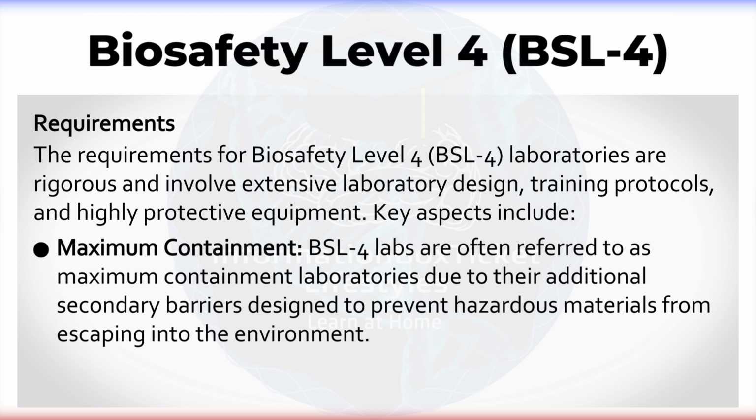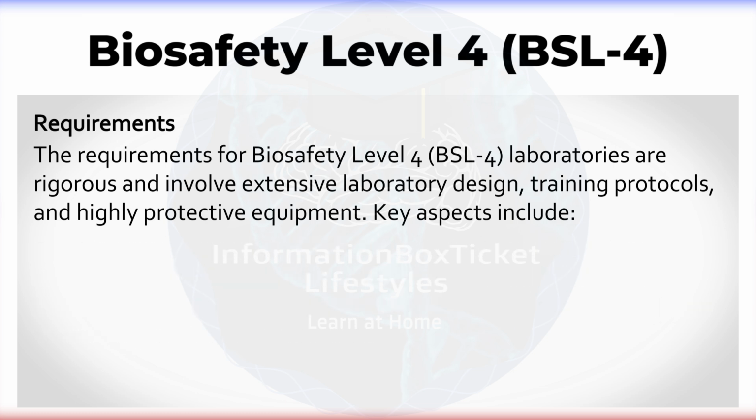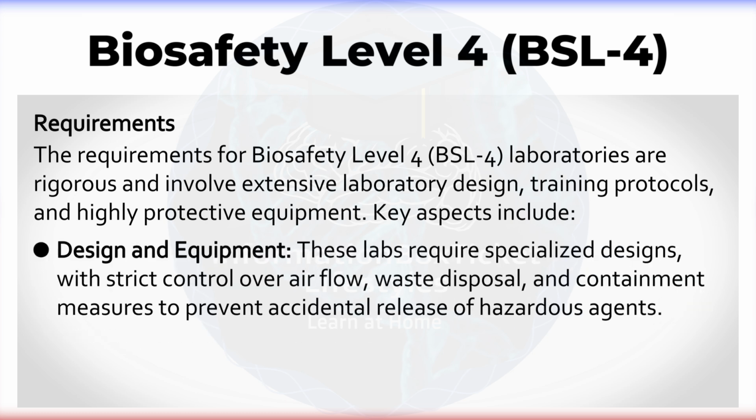BSL-4 labs are often referred to as maximum containment laboratories due to their additional secondary barriers designed to prevent hazardous materials from escaping into the environment. Design and equipment.